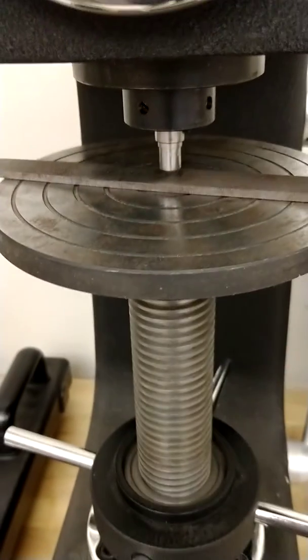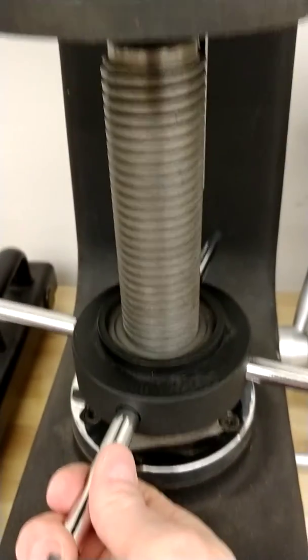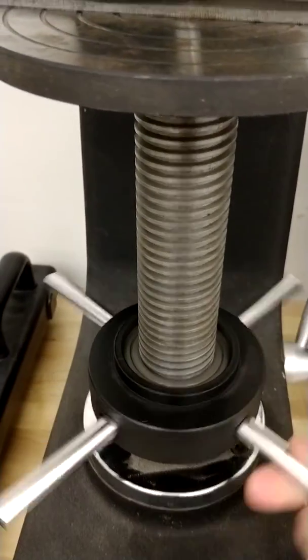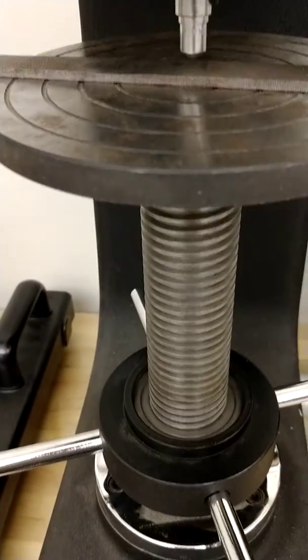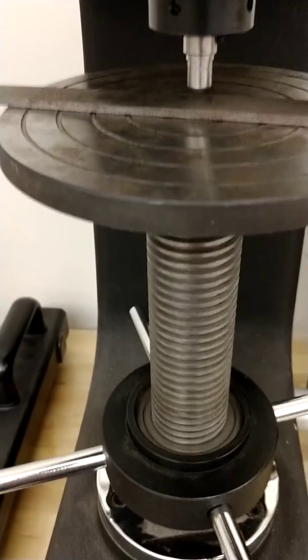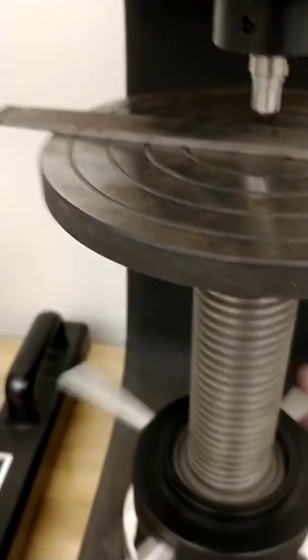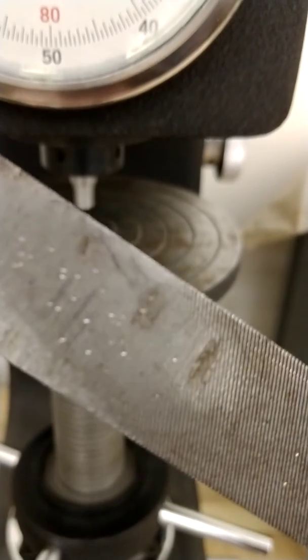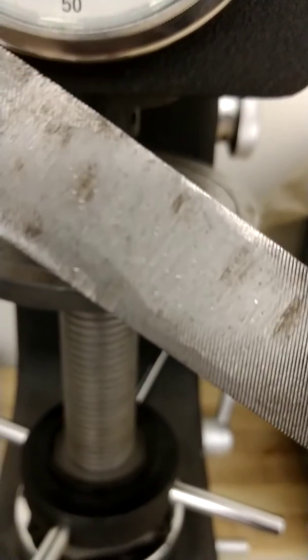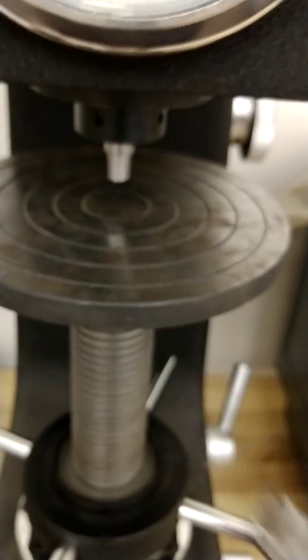To release the part, the diamond indicator is still in contact with the part right now. I need to turn the hand wheel counterclockwise — righty-tighty, lefty-loosey. To bring it up into the part I turn it clockwise; to release the part and move the table down, I turn it counterclockwise. That releases the part and my hardness test is complete. You can see all the indentations in this file from the various hardness tests we've taken. That's basically how we hardness test a workpiece on our Rockwell C hardness tester.